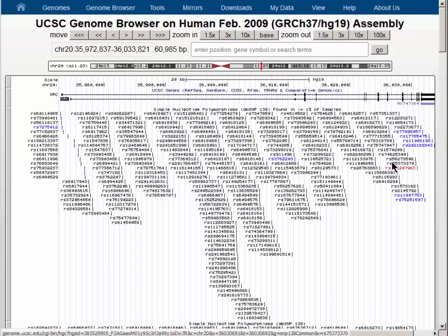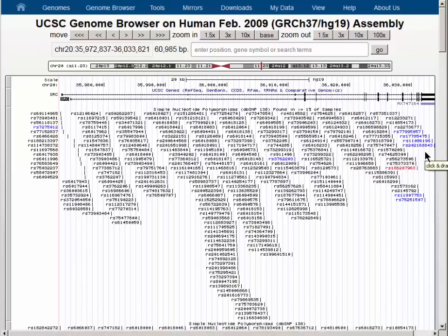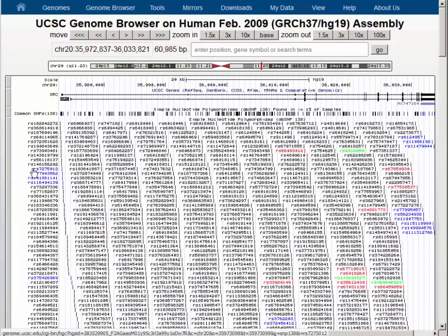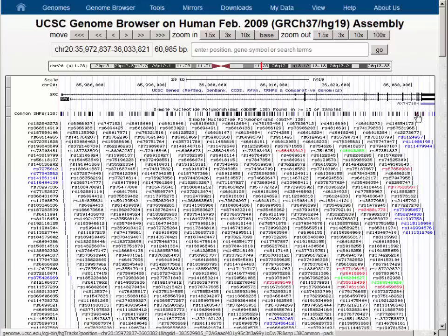We see that we get a very large number of SNPs with their RS numbers on the screen. The red ones are amino acid changes. The blue ones are splice sites or untranslated regions. The black ones are intronic regions. The right mouse button will let us collapse the track down to a single row — put it as dense — and you can see that they're well distributed throughout the gene.